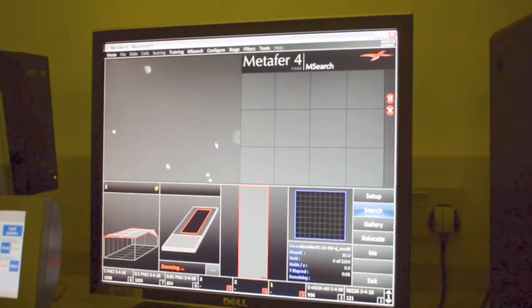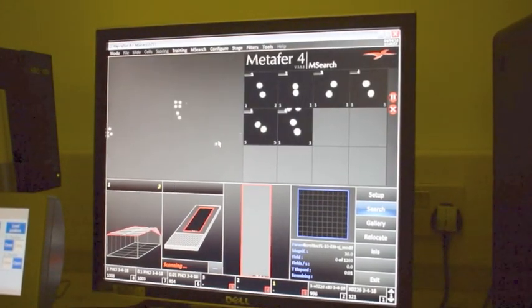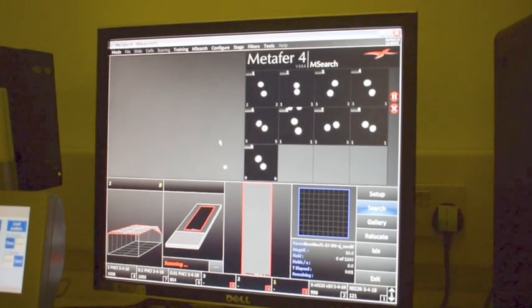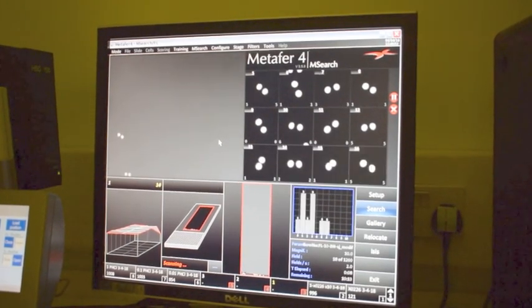The cell images are captured and the gallery is then checked by eye to avoid capturing of false positives and false negatives.